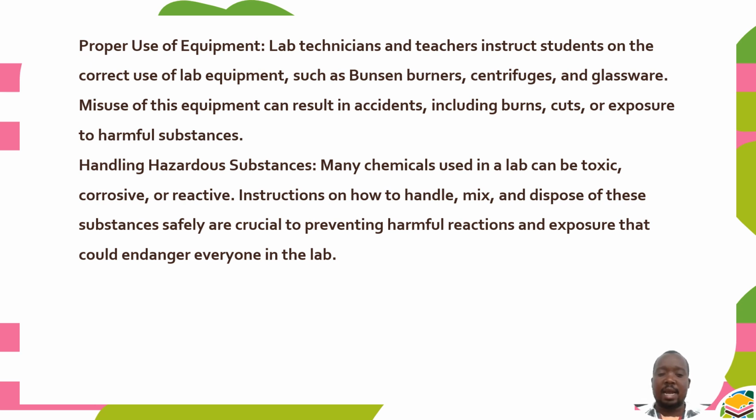So, handling hazardous substances. Many chemicals used in a lab can be toxic, corrosive, or reactive. So instructions on how to handle, mix, and dispose of these substances safely are crucial to preventing harmful reactions and exposure that could endanger everyone in the lab.